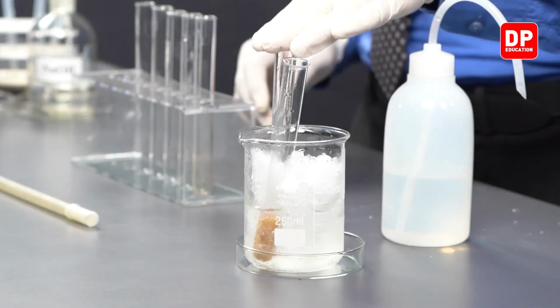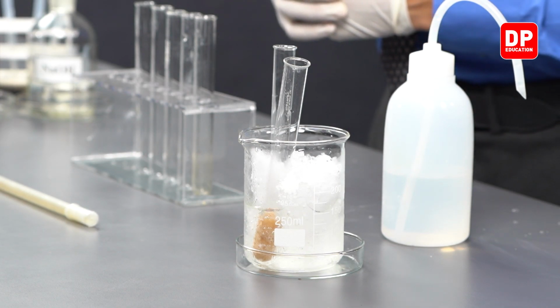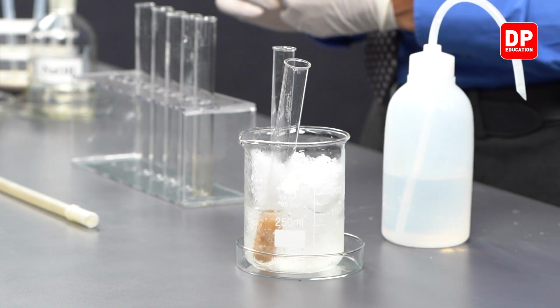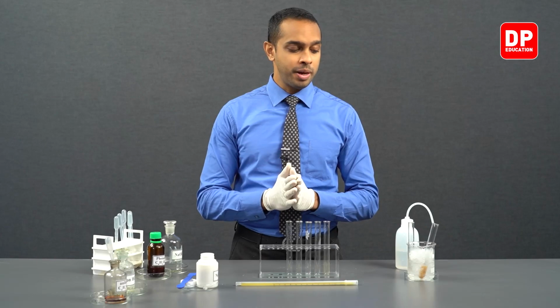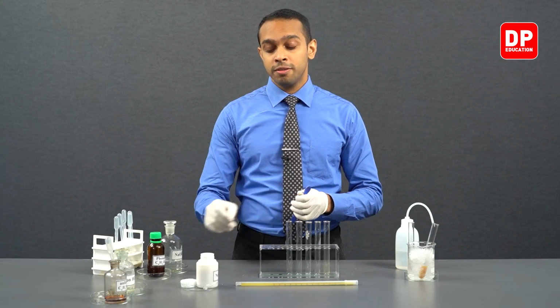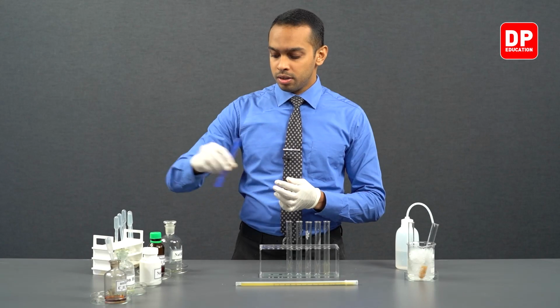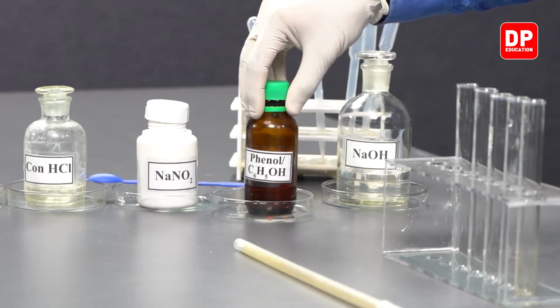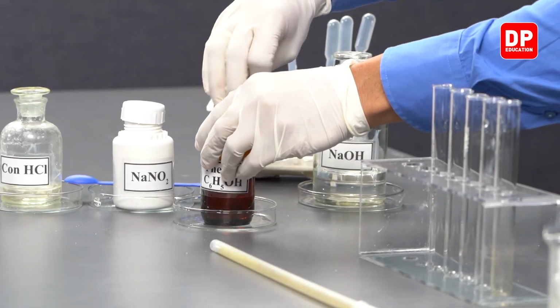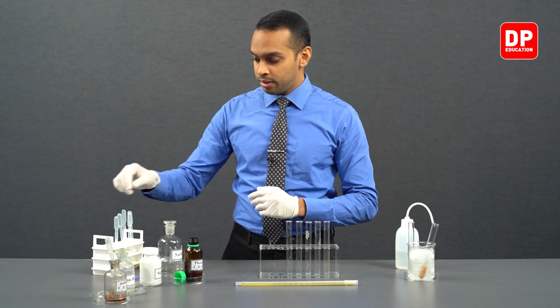Now we have two test tubes here, one containing aniline and hydrochloric acid, and the other containing our sodium nitrite solution. Now, after preparing our sodium nitrite solution, we are going to prepare our phenol solution. We have our phenol sample here. We are going to take a small amount of phenol and add 10% sodium hydroxide to it.